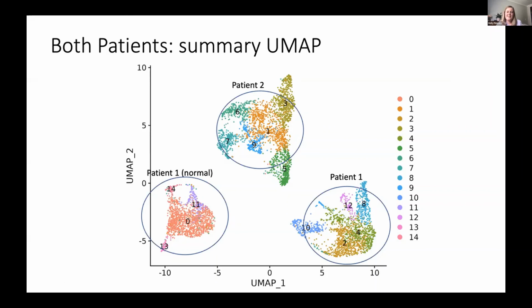What I think is interesting is that the normal tissue from patient 1 clustered so far away from the tumour tissue. But again, that could just be from the fact that the section was taken so far away from the primary tumour itself. Yeah, so if you recall, the ovary region from patient 2 was mostly up here. The normal was mostly this greeny colour, so they're pretty far away from each other. So you would think they're quite different.